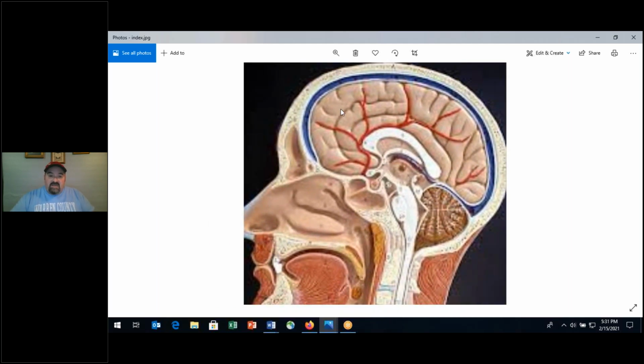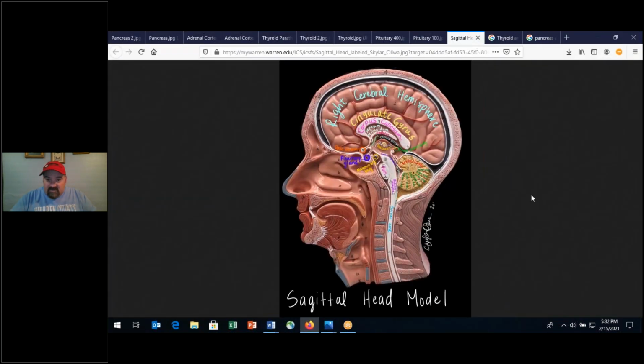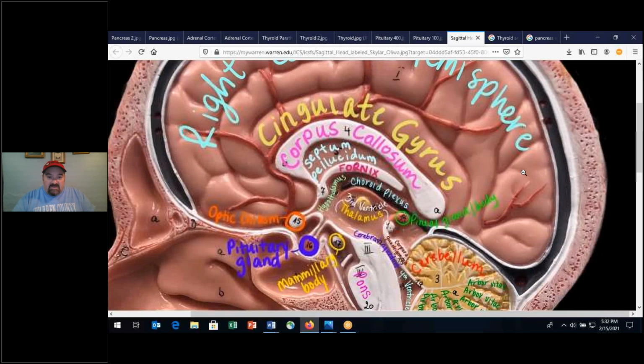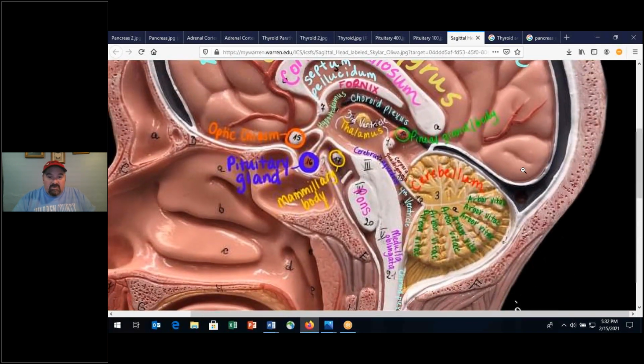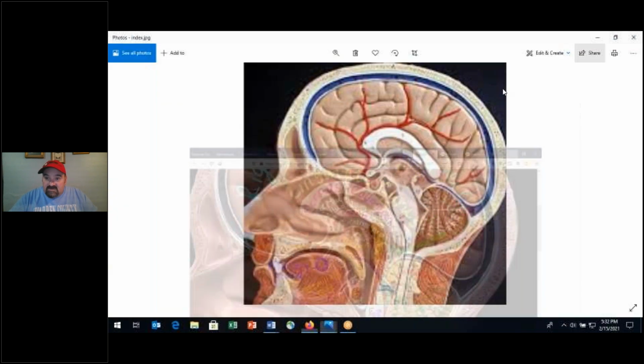So as we're looking at here, please take advantage of this image here that was posted by Skylar from last semester. If you increase this image here, folks, really cool as far as what she's done. As far as giving you all of this information, right? So that you have that as information that you can refer to, okay? So really helpful.